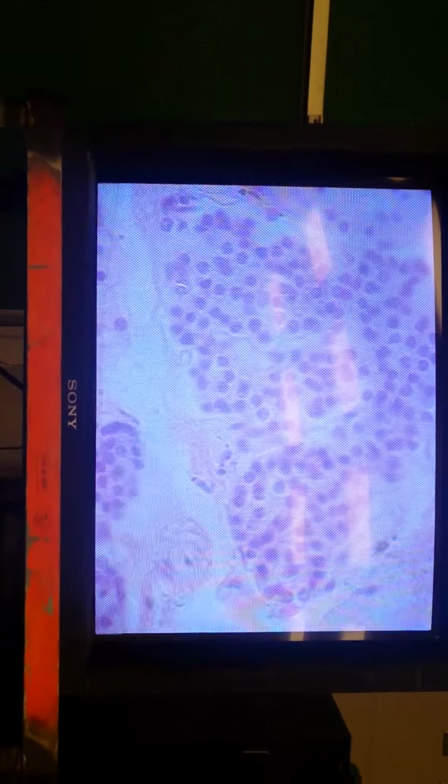But these are not acini. The chief cells hardly have any cytoplasm around their nucleus. They're very small cells. Whereas these oxyphil cells, you can see nucleus, cytoplasm, and even cell membrane in some places. Much more cytoplasm, bigger cells. The little cells are not organized into rings with light centers, so it's not a pancreas slide.